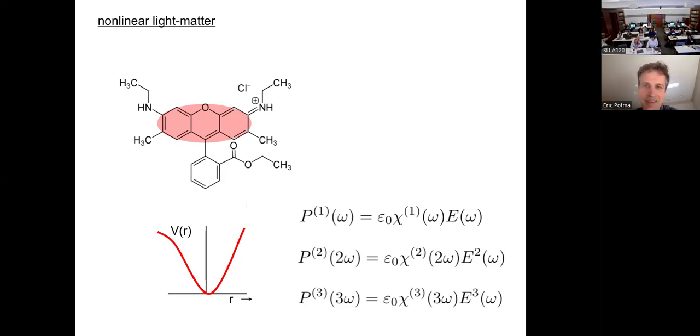All right. There's another question in the audience. Yeah, please. Is the electric field that's in the equations the incident electric field? Yes. Those are electric fields that come in to your sample. Right now I just make this like one E, but these two E's here with the square, actually it could be E1 and E2. So that could be of different frequencies, in fact. But here I just write them as being the same.